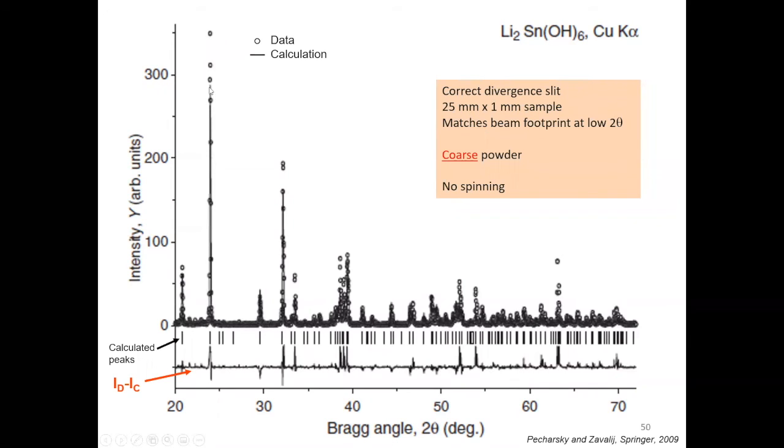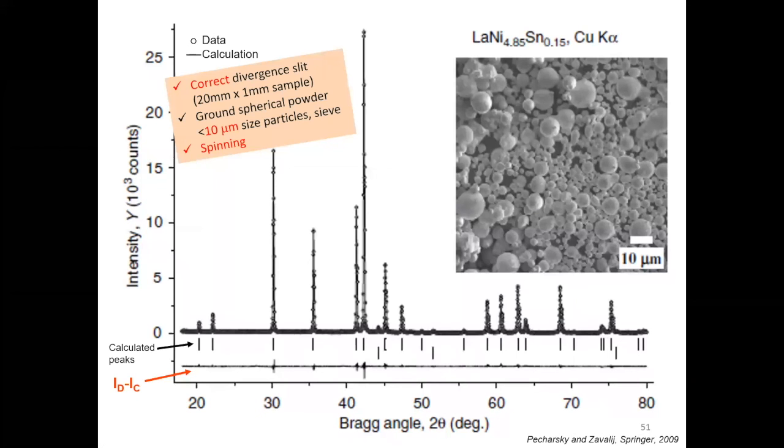So if you see differences like that, please talk to the instrument manager and be aware of this. It's very important if you have small quantities of material, as many users do not have a large amount of powder to use in the analysis. Make sure that you use the proper sample holder. There are sample holders that have low background.